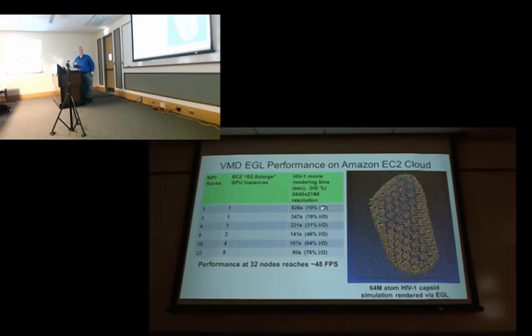Or if we run on 32 nodes, we've crushed the rendering time, and so most of the time is then spent on disk I/O. And we've taken the runtime and reduced it by a factor of 7 or whatever. So you can see the impact of that as we speed it up further. If you get to rendering long movies, like some of the ones we've done here that have tens or 20s of thousands of frames, this can be very helpful, particularly if you're using high-quality rendering and things like that. And we can do this using off-screen rendering.